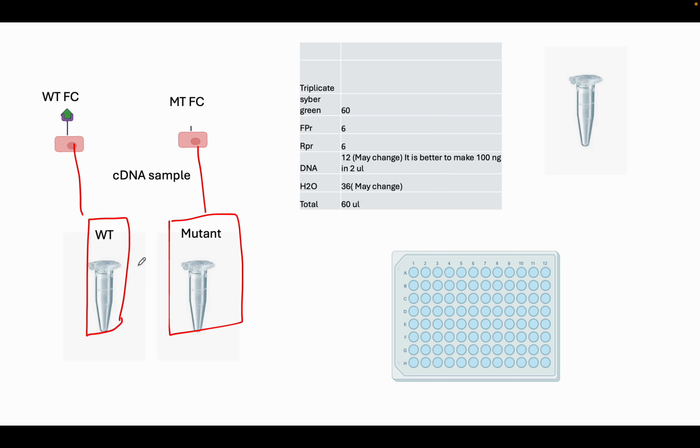And now I am going to check whether in this mutant sample the thyroglobulin gene is expressed or not. In other words, whether the thyroglobulin RNA is found in this sample, and I am expecting that it has to be in this sample because I have not done any genetic manipulation in these cells. These are wild type cells.